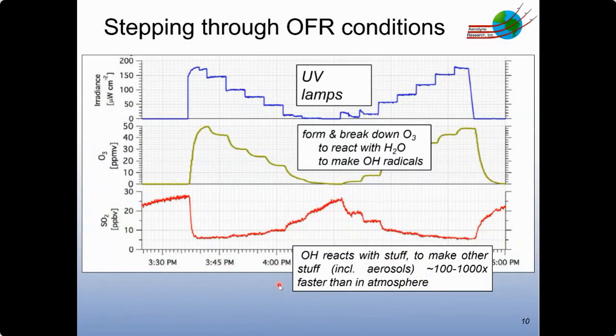So how does this work in practice? Well, as I mentioned, the OFRs are operated in steady state, continuous flow mode, unlike most environmental chambers, which are operated in batch mode. And so what happens in practice is, this is an example time series of OFR data from the PAM OFR, where over time, we're stepping through different steady state conditions.